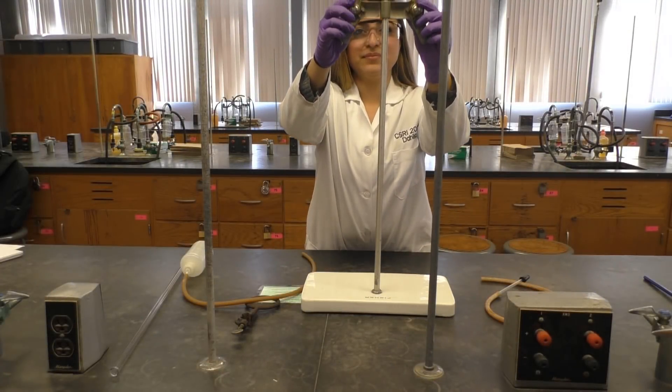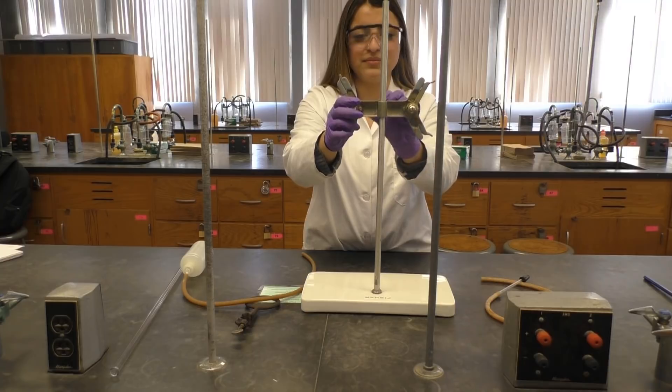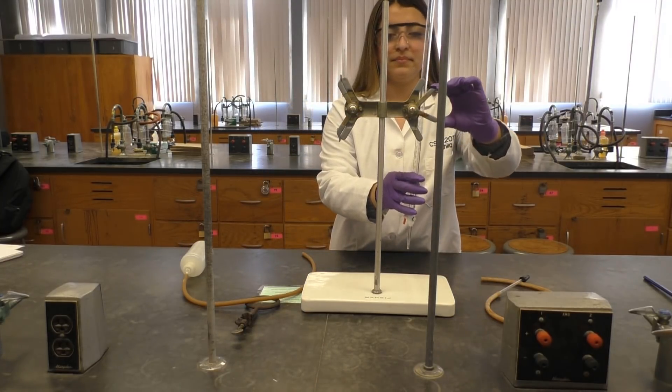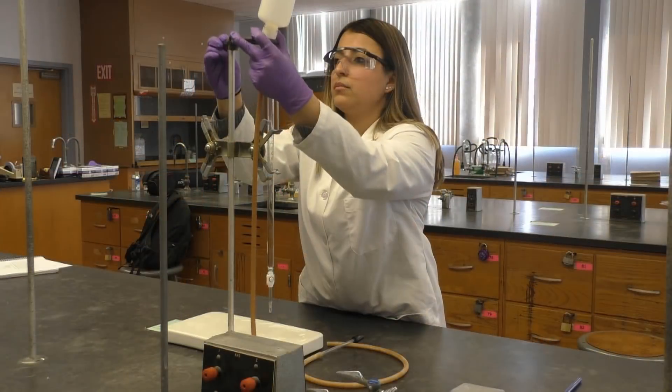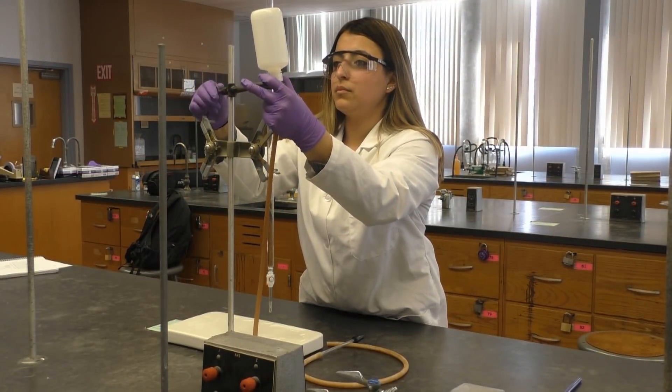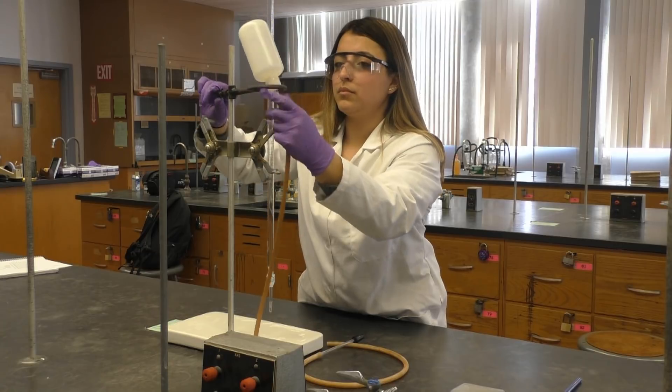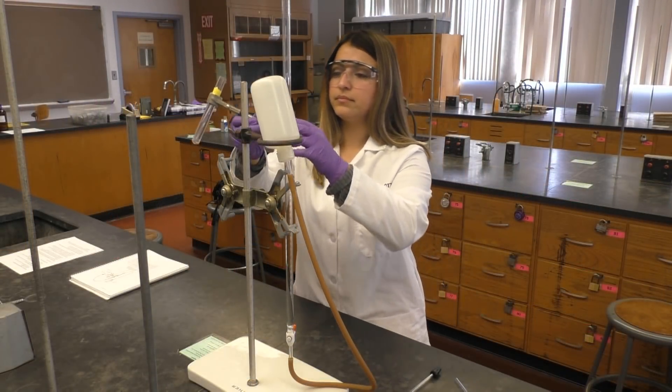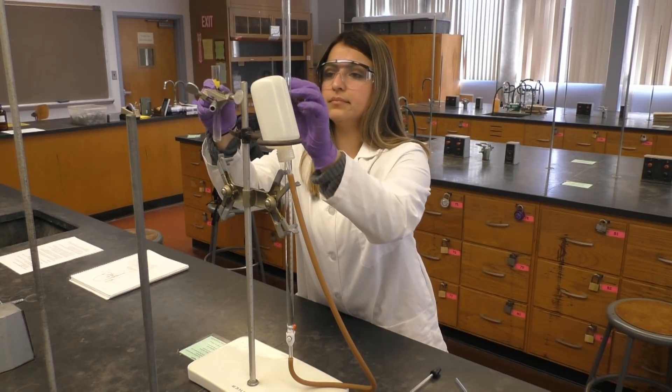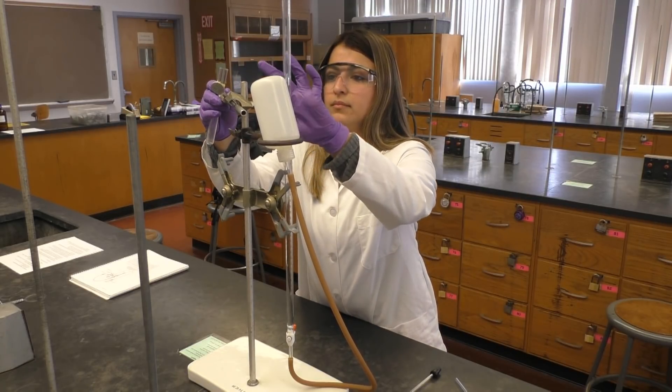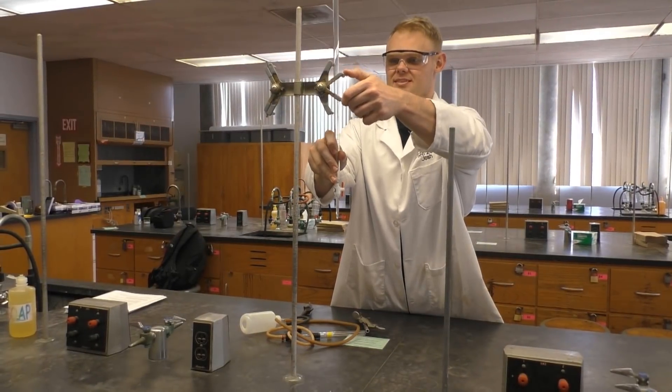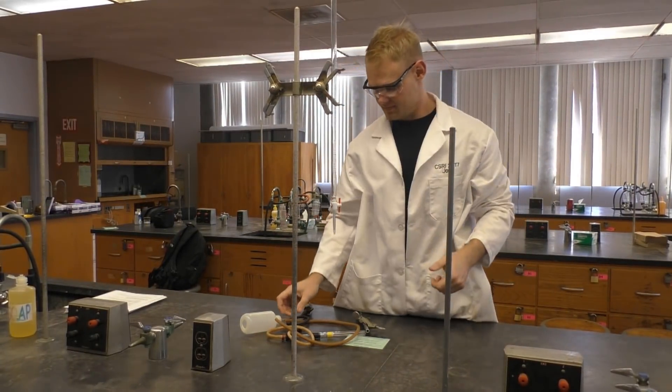First, clamp your burette holder to the burette stand. Then clamp your burette to the burette holder. Next, clamp your leveling bulb to the pole, then clamp your large test tube to the pole. Additionally, instead of a burette stand, you can also use the poles in the middle of the lab bench.